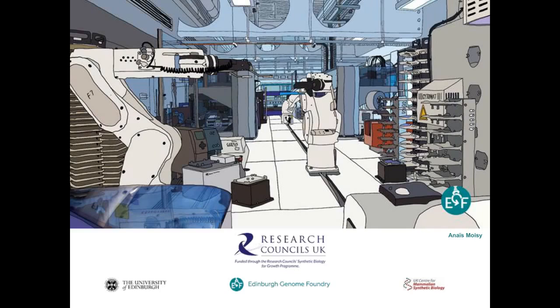Which software and equipment generate the information and label about the sample? And is it the ICE repository or anything else? It depends on what you mean by information label, but if you mean what parts have to go into an assembly, yes, that is done by querying the ICE database. So the ICE database essentially has all of our parts. It doesn't contain information about which parts can fit together to make a viable assembly.